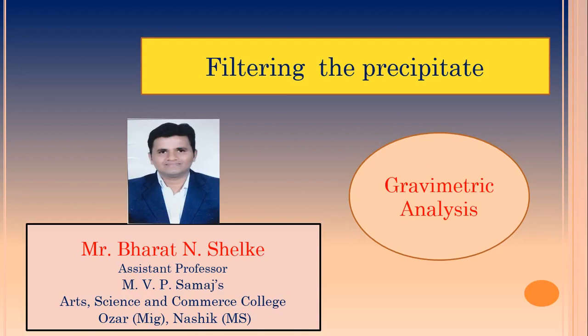This video explains the filtration process for the precipitate. Up to this point, we discussed how to prepare the precipitate and how to remove the impurities, that is co-precipitation and post-precipitation. So in this video, the filtration process is explained.